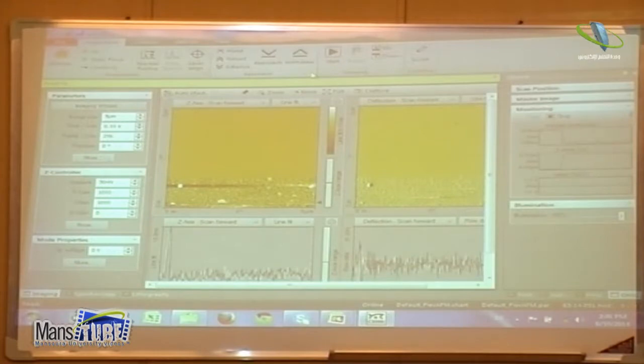Now what I will show you is not how to prepare the sample. I will show you how we put it in liquid media, and then you can measure in liquid. This is the idea. You can have any kind of Petri dish or something. You put it inside liquid, and you can measure. This is not a problem. Okay?